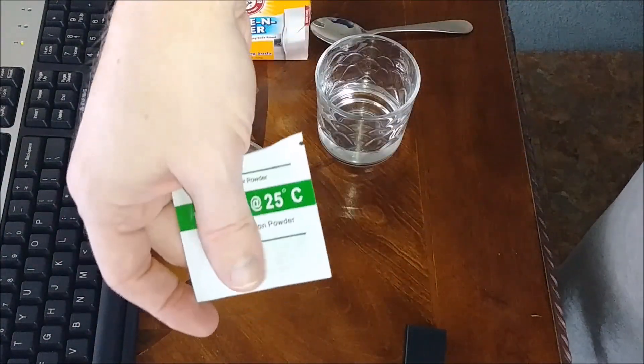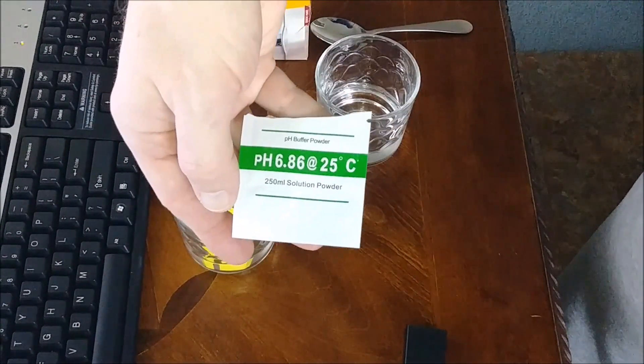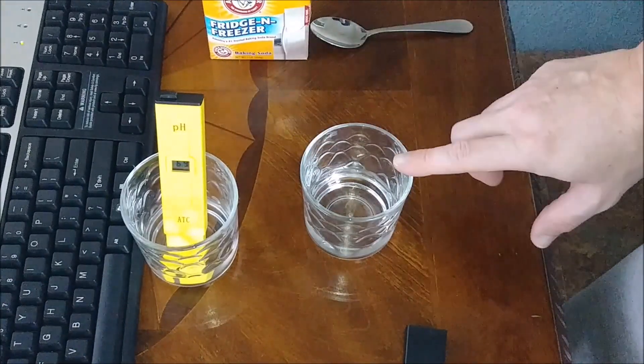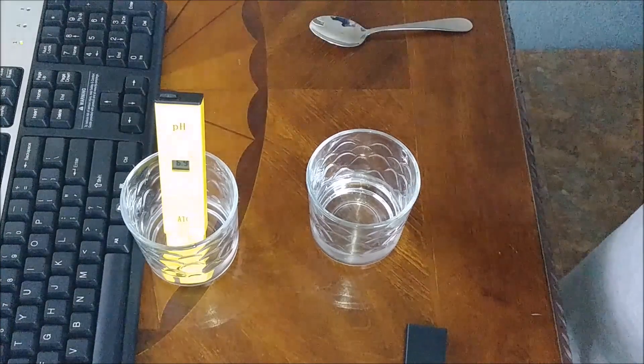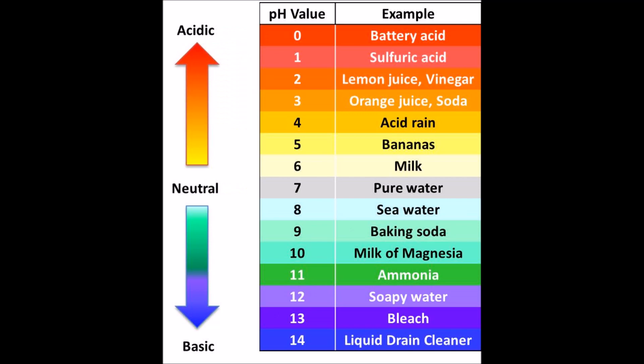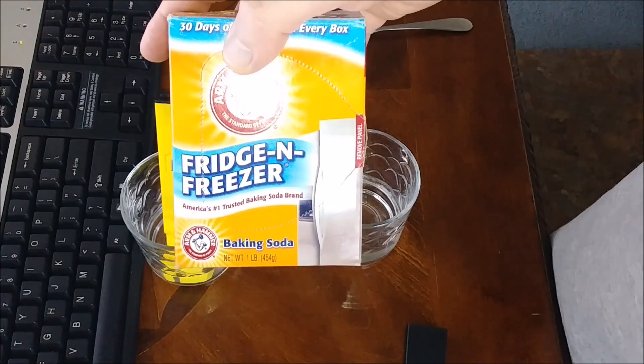So what if you didn't have one of these packets and you used it up? How are you going to pH test this? According to the internet, baking soda has a pH property of 9.0. I'm just curious to put a tablespoon of this into just a little bit of water to see if we can use this for a pH solution. So let's go ahead and try it.